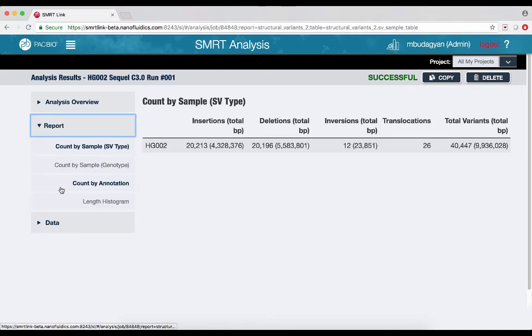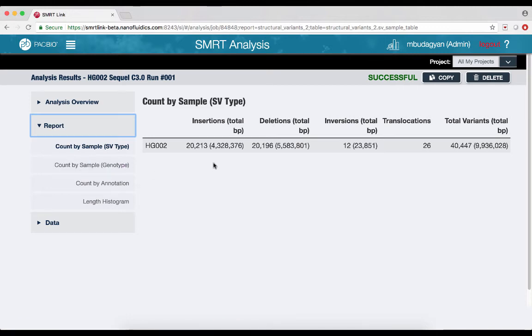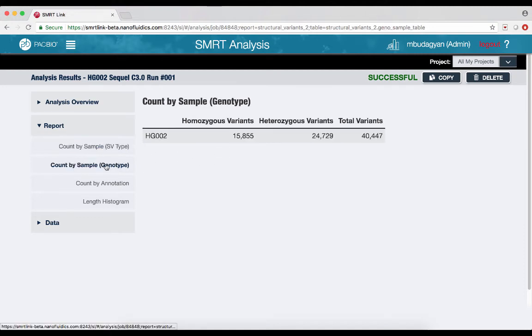The report Count by Sample SVType section displays the breakdown of types of called variants by count and length in base pairs. The report Count by Sample Genotype section describes the genotype breakdown of called variants.